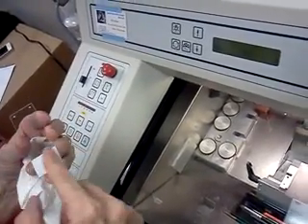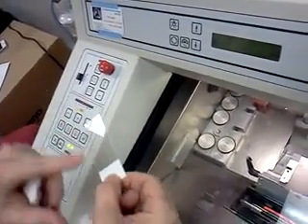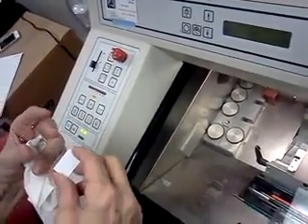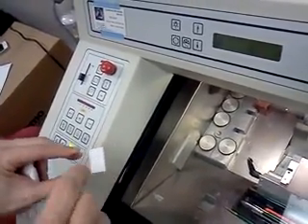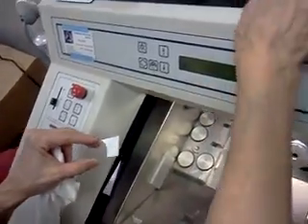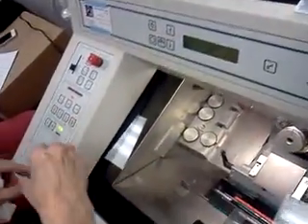Now there's a right side. That's where you lay them. And there's a wrong side. If you put the tissue on this side, it doesn't have the coating. Plus, you can't label on it. But they do that on purpose, so you put the tissue on the right side. Okay, so that's all the parts that we need to know about.